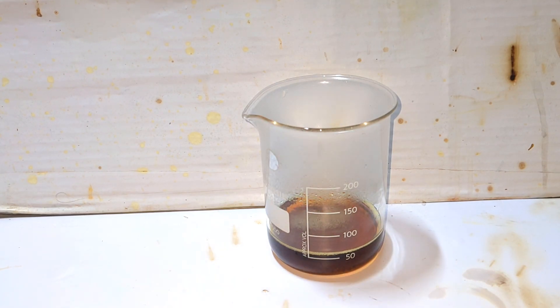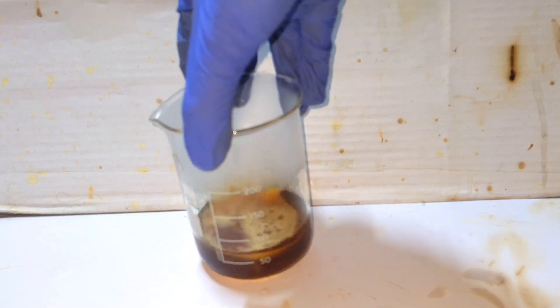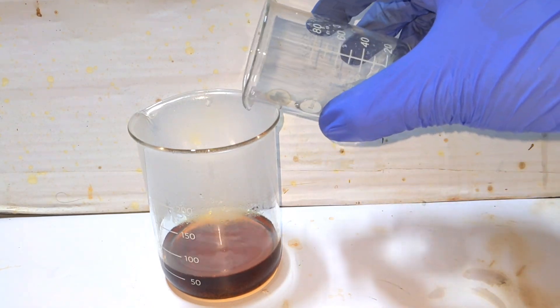Continue adding the hydrogen peroxide slowly in small lots, with frequent swirling of the beaker to ensure complete reaction. Finally, we add the ammonium sulfate solution to the ferric sulfate solution.